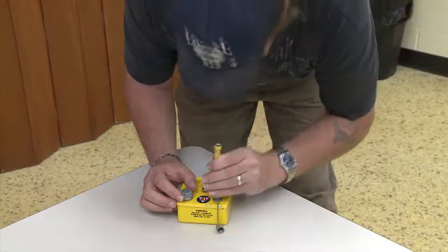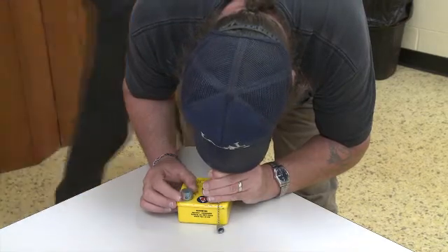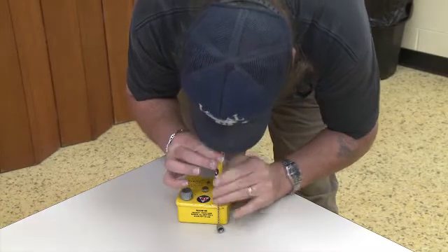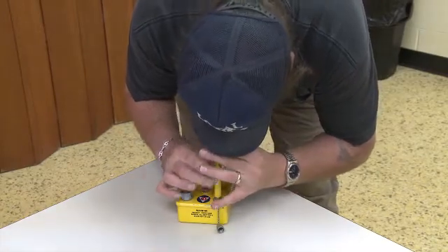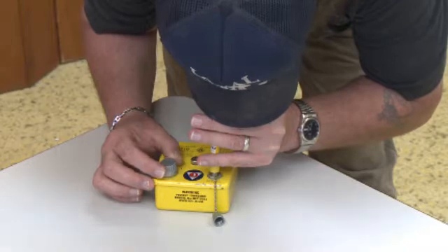Now you will zero the dosimeter by placing it on the charging pedestal and pressing down gently. While the dosimeter is pressed down, look through the eyepiece and adjust the upscale and downscale control knob until the line rests slightly below zero.